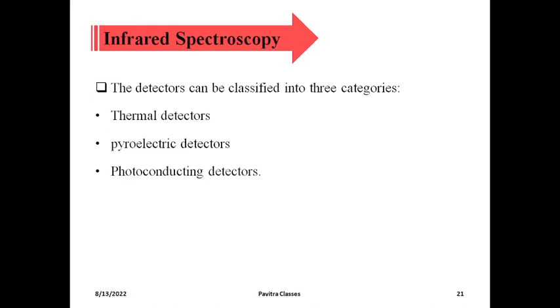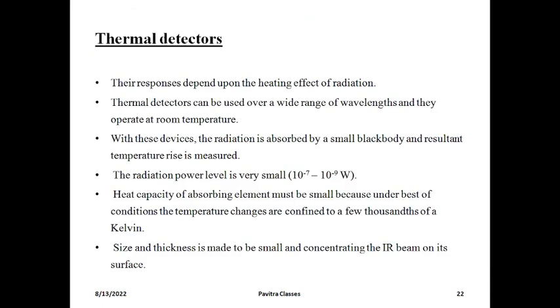The detectors can be taken into three classes: thermal detectors, pyroelectric detectors and photoconducting detectors. We will study them one by one. One is the thermal detector. Usually their response depends upon the heating effect of the radiation. Thermal means heat, so how much heating has taken place can be identified with thermal detectors.